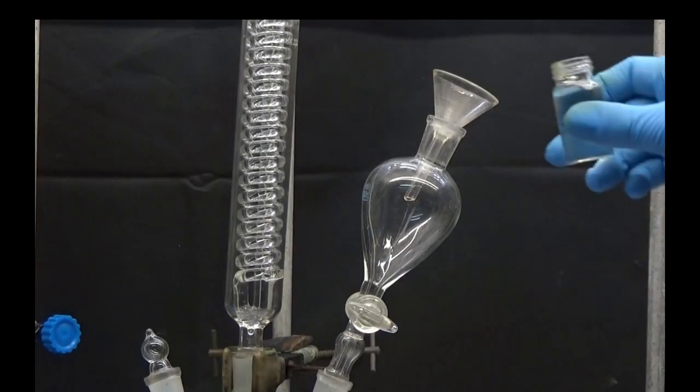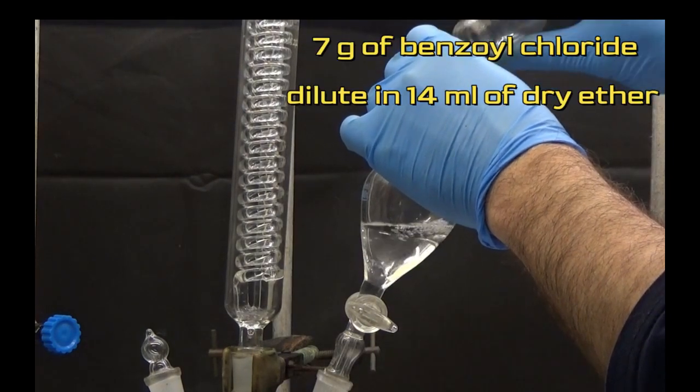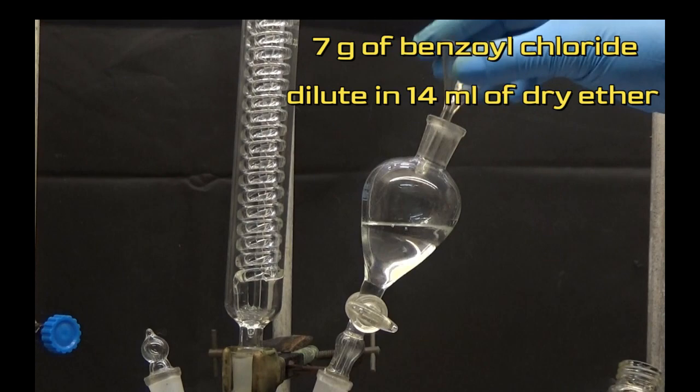Once the magnesium has completely dissolved, add 7 grams of benzoyl chloride with 14 milliliters of dry ether in 10 minutes.